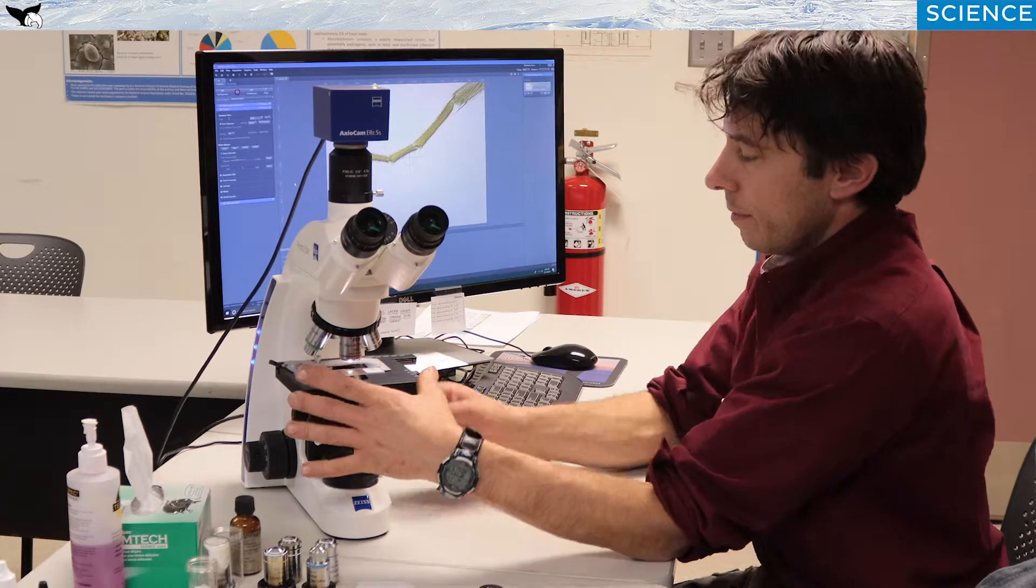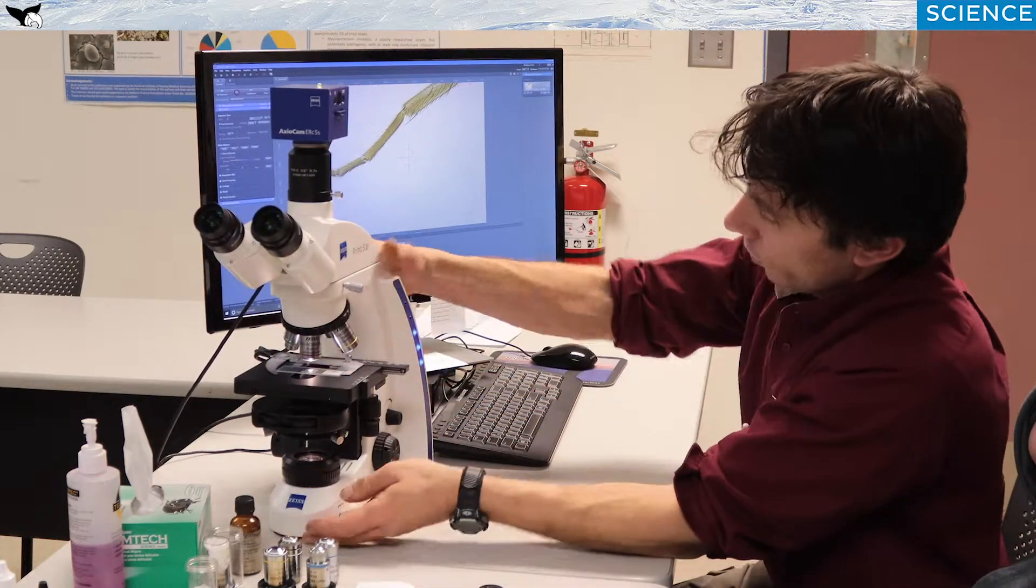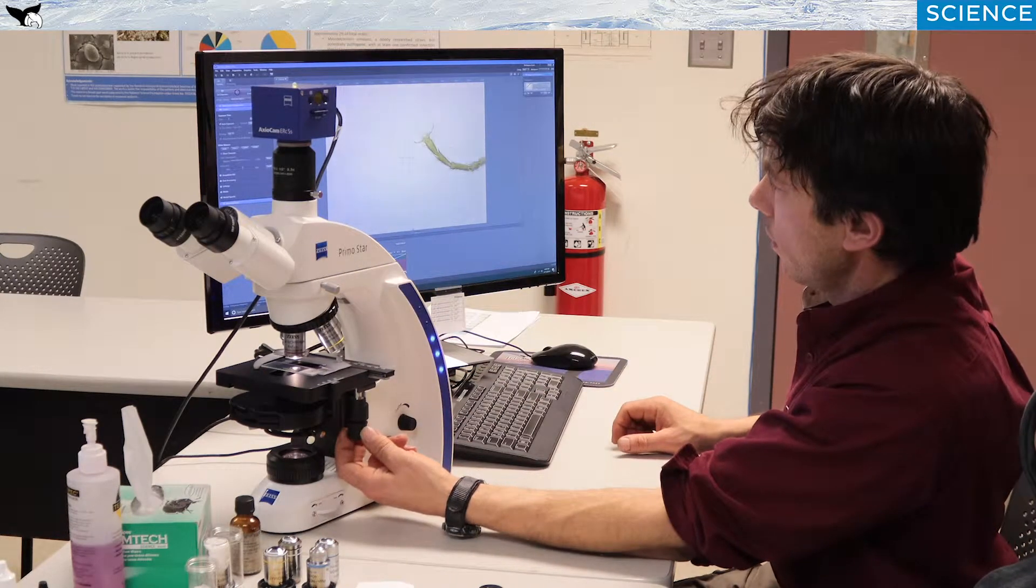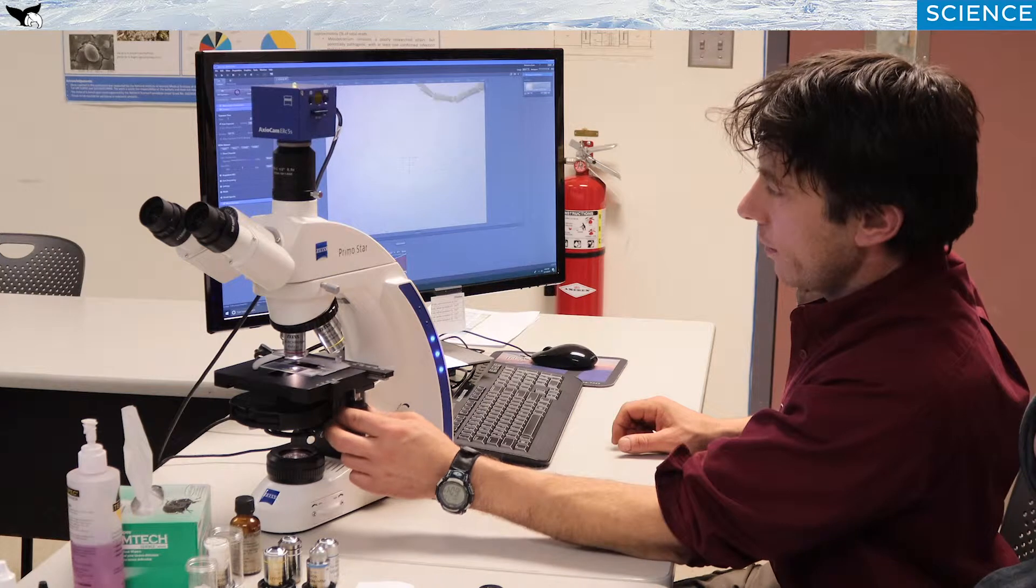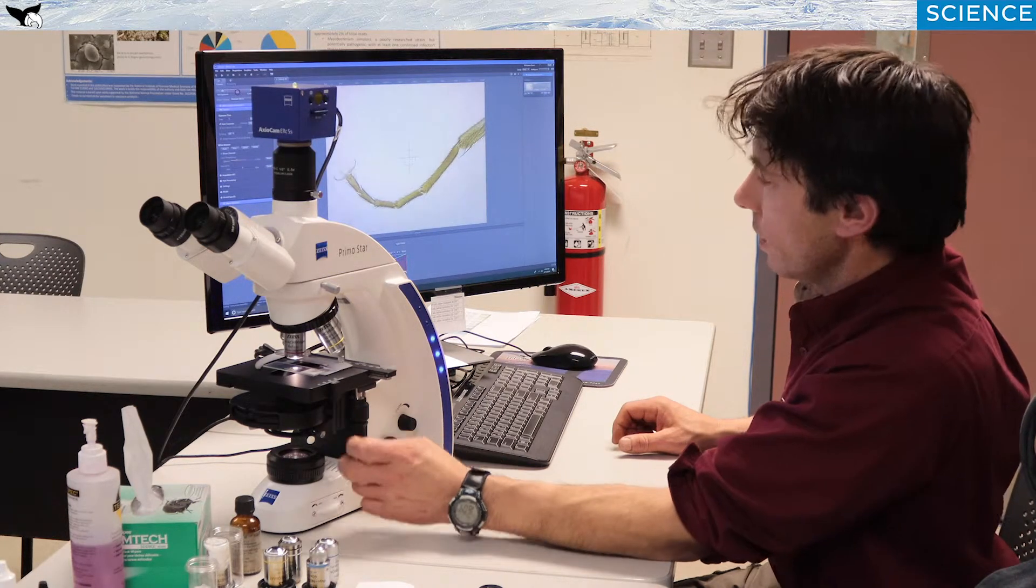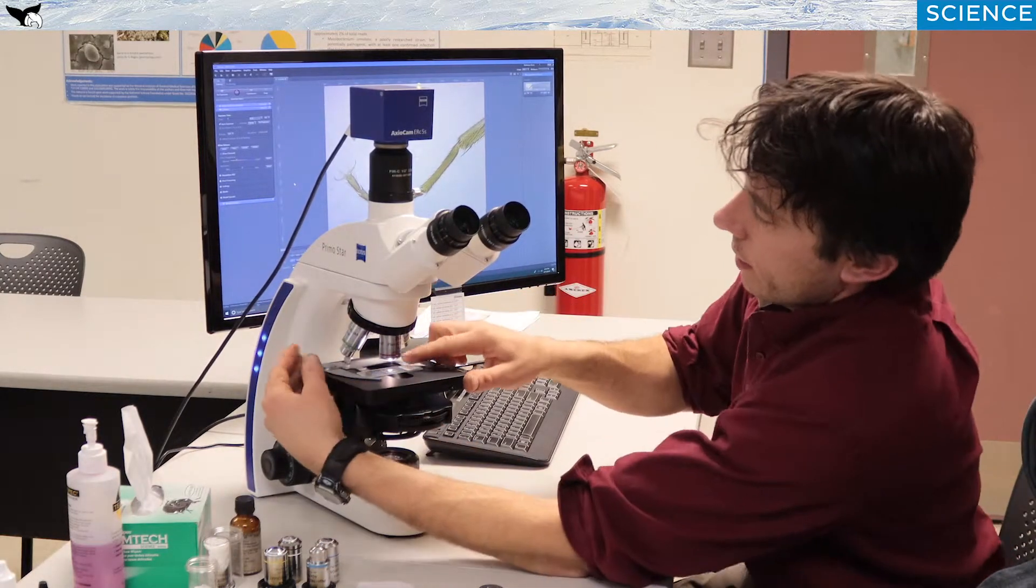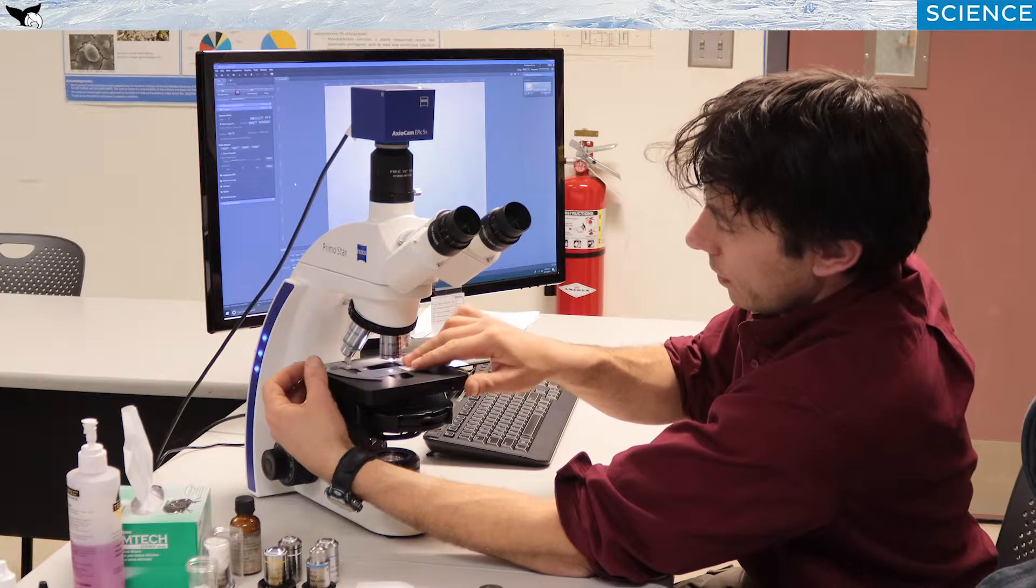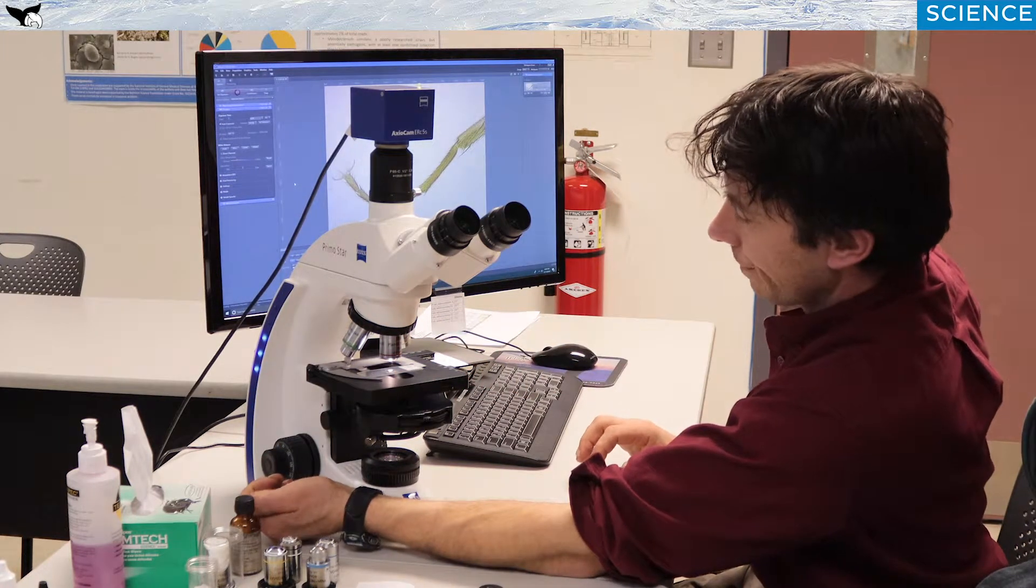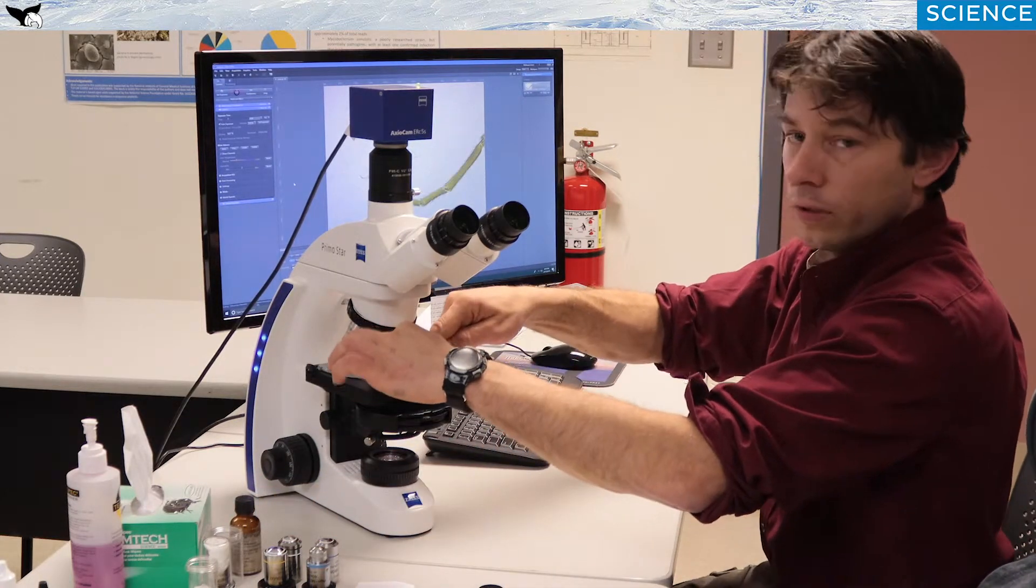So next area up is the stage. We have two controls over here that control the x-axis and the y-axis for real precise movements, particularly when we get to higher magnifications. On top of the stage should be some type of a specimen holder. In this case, it's a little spring clipped specimen holder. On the simpler scopes, there are two little spring-loaded fingers that just hold it down.